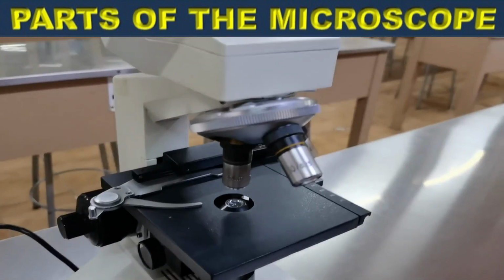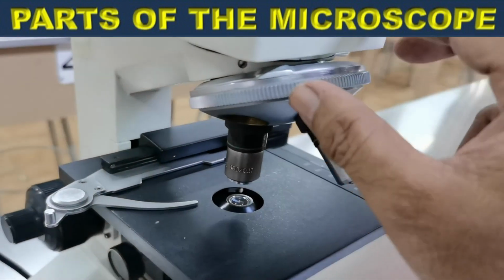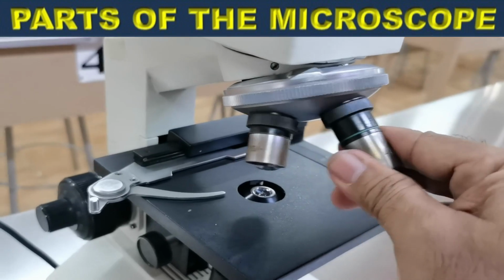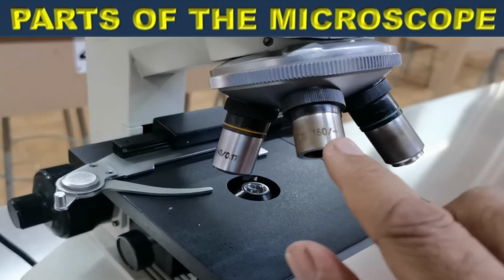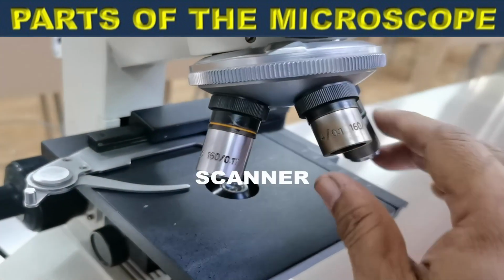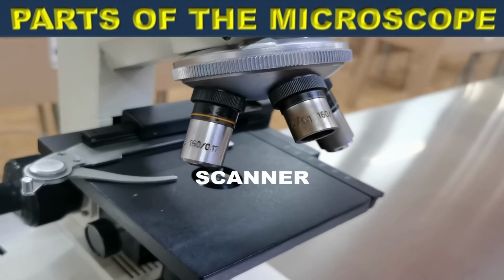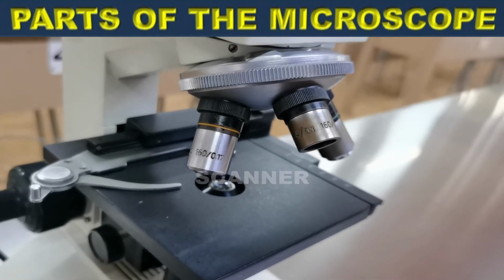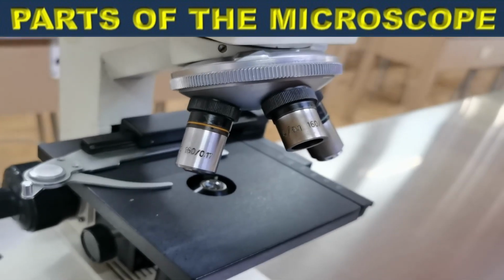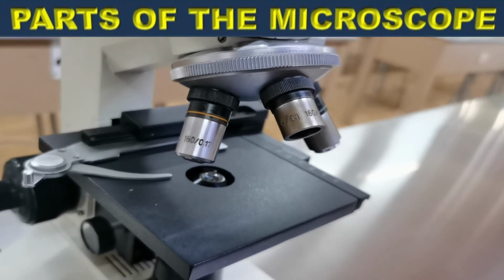Let us now study the objective lenses here. So we have the following objective lenses. The short one is what we call the scanning objective lens, that gives you a general picture or an overview of the specimen.